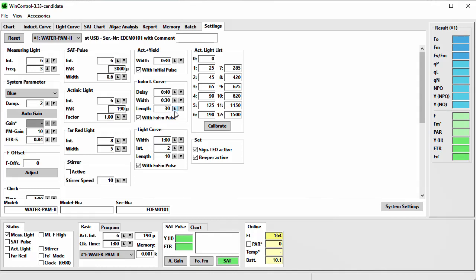You can change these values using the arrow buttons or by entering a value. The actinic intensity for illumination during the induction curve is set here or below in the status panel. The light curve protocol parameters are: Width — the interval of each illumination step; Intensity — the start intensity according to the actinic light list; and Length — the number of actinic light steps with increasing light intensity. In this example protocol, the instrument will perform an FO/FM measurement first, then perform 10 light steps each for one minute, increasing the light intensity starting from intensity 2 to actinic intensity 11.